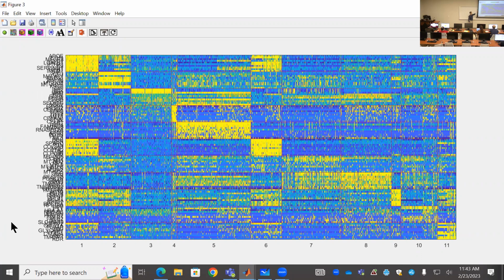You want to put in the report, or you want to show people. This is just one method. You see, you have 3 different methods to select to generate a slightly different heat map of those marker genes. There are other buttons if you want to try, you can click. I don't even remember what they are.